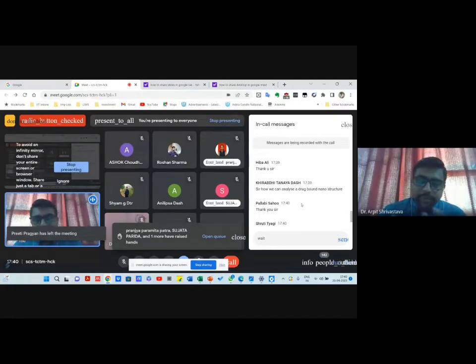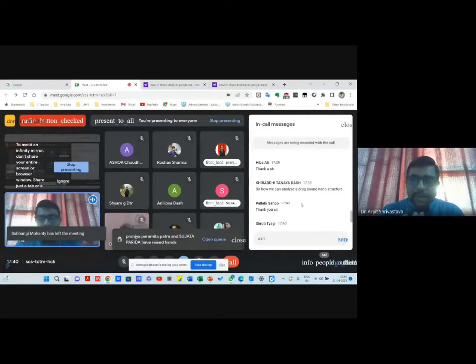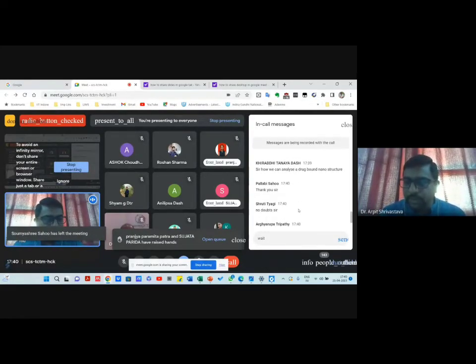So we will do the cytotoxicity assay or annexin assay or apoptosis assay, whatever we are predicting. So we are not finding the nanostructure, we are just finding whether a particular drug is effective or not. Am I right? If you are asking something else, then let me know. And somebody else.